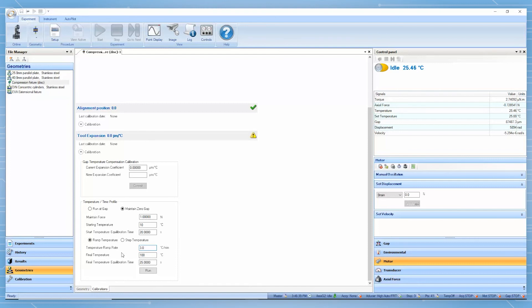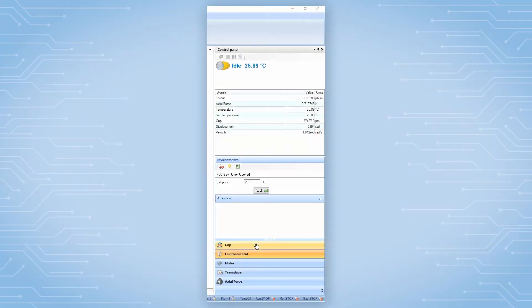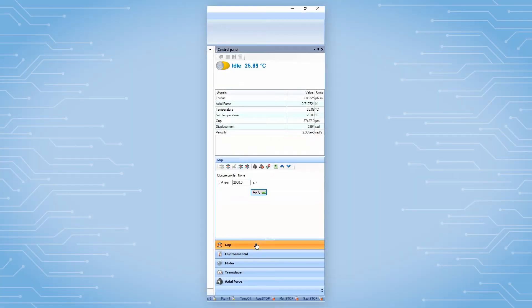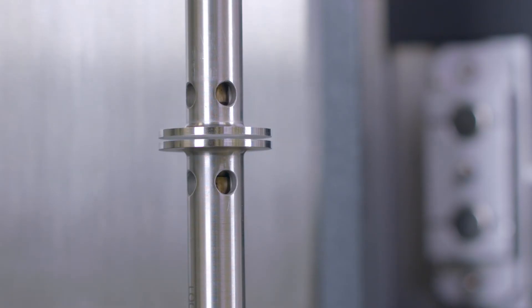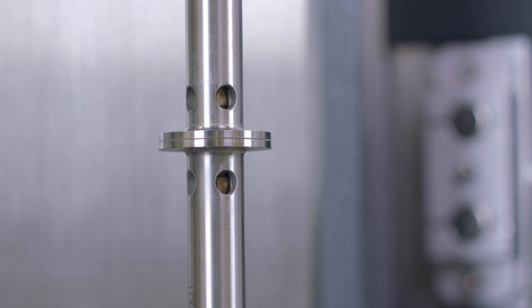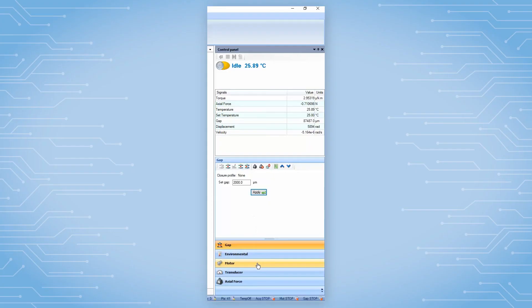After all calibration steps are completed, close this page. From the instrument control panel, perform geometry zeroing at the test start temperature, and then set the motor to the alignment position.